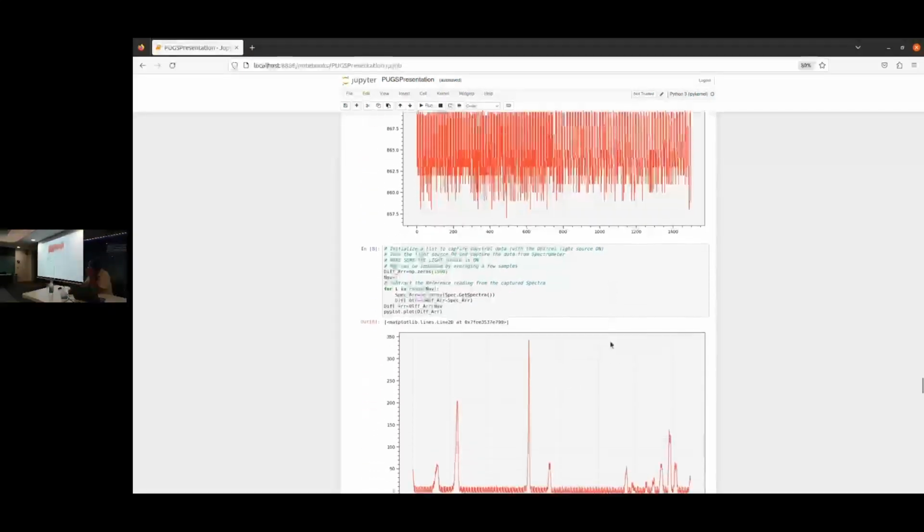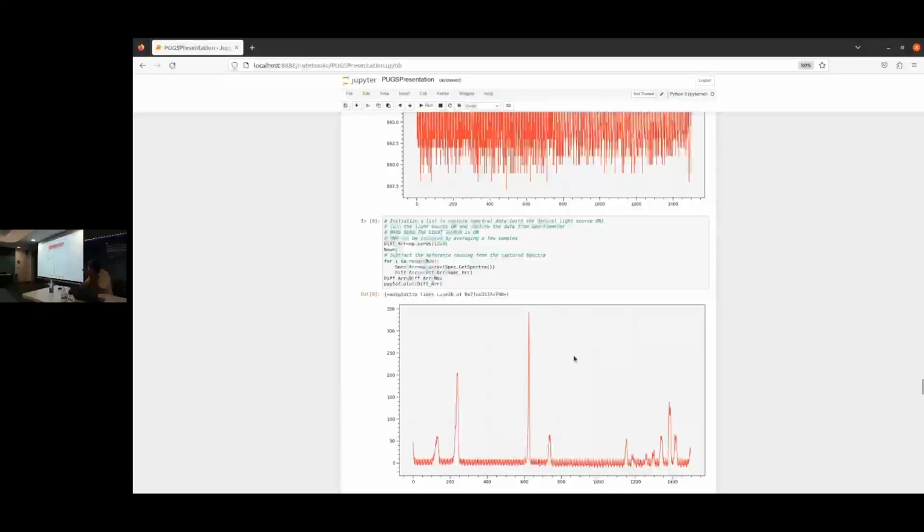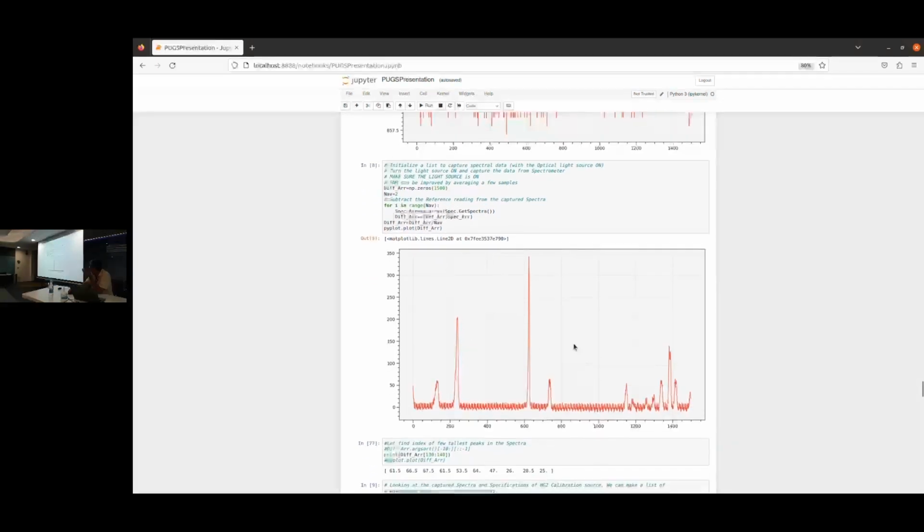After that, just a little bit about calibration, since we are looking into the device. You connect a calibration light source. It tends to be a mercury argon or a gas lamp of some kind. And from your physics days, you'll remember that these lamps give discrete wavelengths. At discrete frequencies, they give peaks, right? So you capture these peaks, and you know what the wavelengths of these peaks are. So you can calibrate your pixels. And this device has about 1,500 pixels.